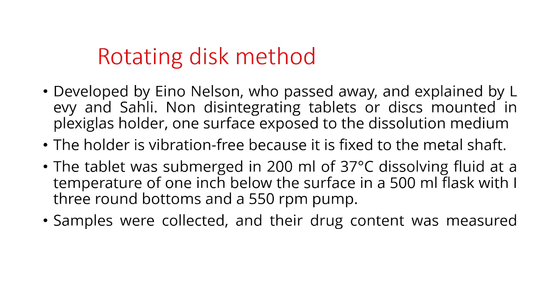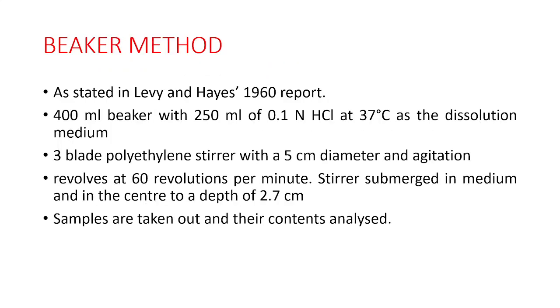In the rotating disc method, non-disintegrating tablets are mounted in a plexiglass holder, with one surface exposed to the dissolution medium. The holder is vibration free because it is fixed to a metal shaft. The tablet was submerged in 200 ml of 37 degrees Celsius dissolving fluid at a depth of 1 inch below the surface in a 500 ml three-round-bottom flask at 550 rpm. Samples were collected and their drug content was measured.